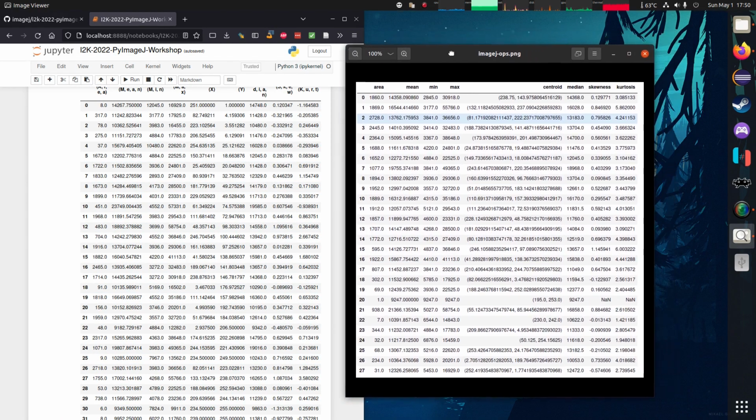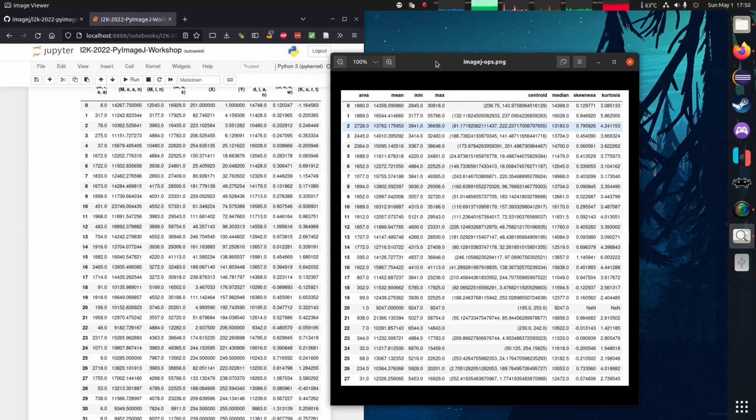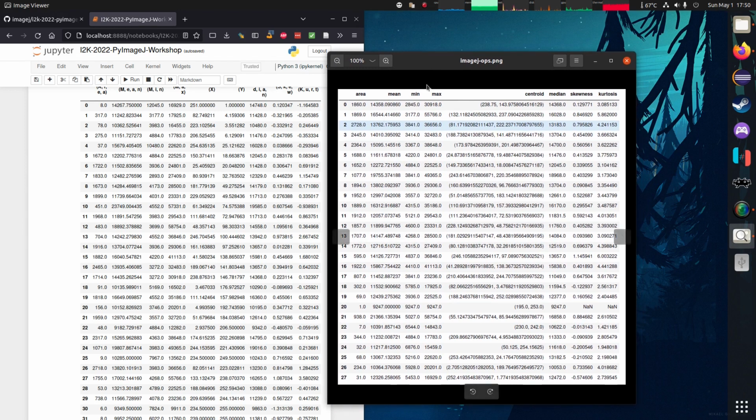Now, a smart person would use pandas sort column to sort by a particular column, but we are just going to eyeball it quickly. I see that row number 5 here is at x150, y18 or 19, and over here item number 6 is also at 150, 18.